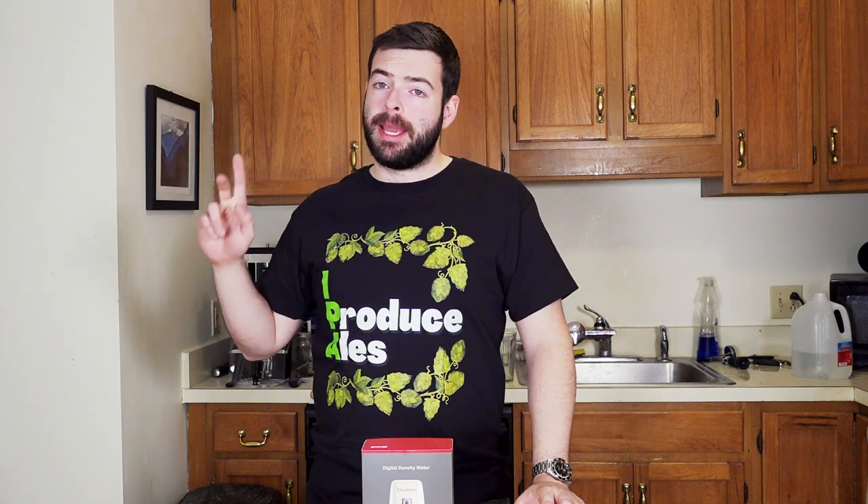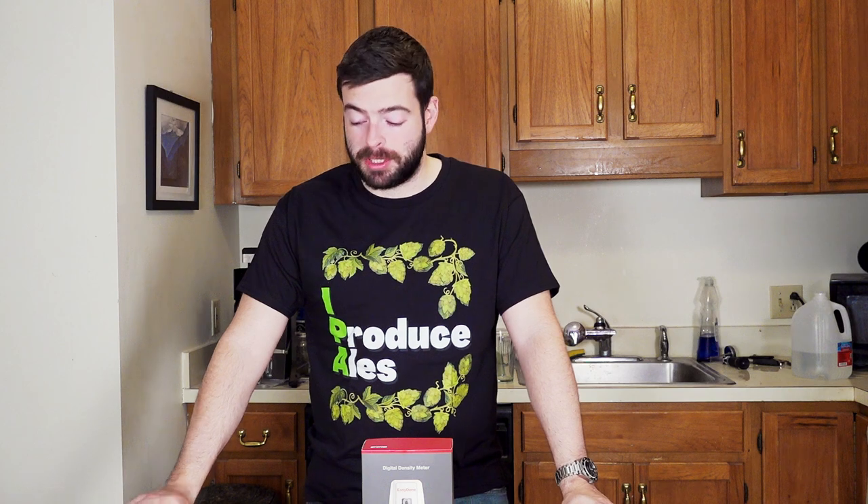Now for the negatives — price. This thing is ridiculously expensive. $350 is not really in every home brewer's budget, and the only reason I have this is because they sent it to me. The ratio of price to benefit isn't all that great, but I do understand they are a foreign company sending essentially lab-grade equipment, so I get it. The other thing is this is fragile. There are stories about people dropping these off the counter and shattering them. So if you do decide to own one of these, just take good care of it — it is precision equipment, it's not meant to be beat up and thrown around.